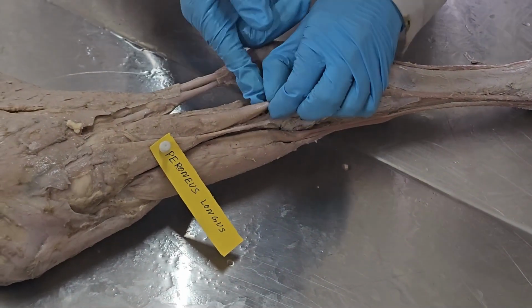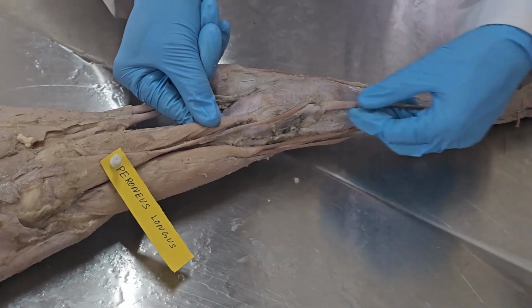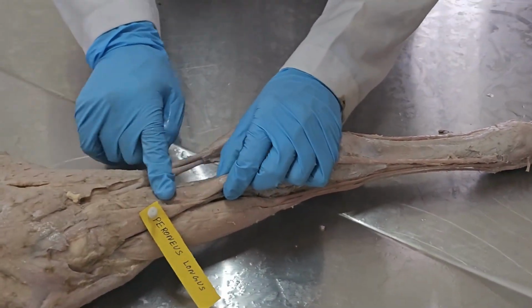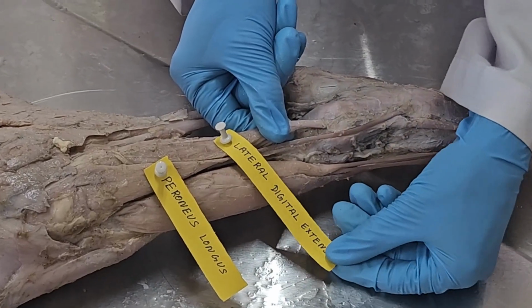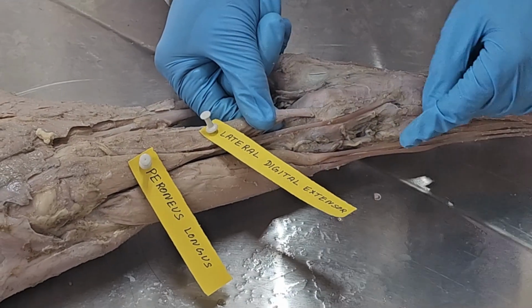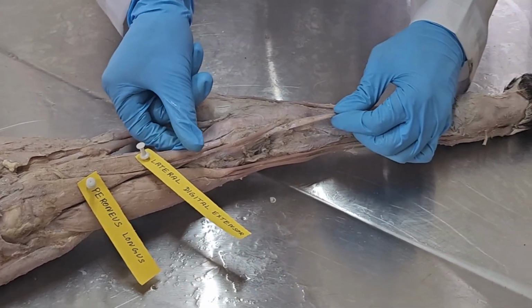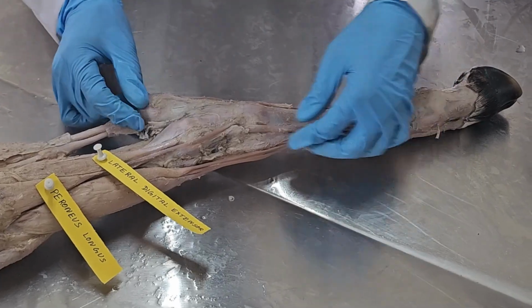Now you can see the tendon here. This is the tendon of the lateral digital extensor, so this muscle is the lateral digital extensor muscle. You can see clearly here. This is the peroneus longus, and this one is the lateral digital extensor. If you pull like this, you can feel the stretching here, the tendon of the lateral digital extensor.